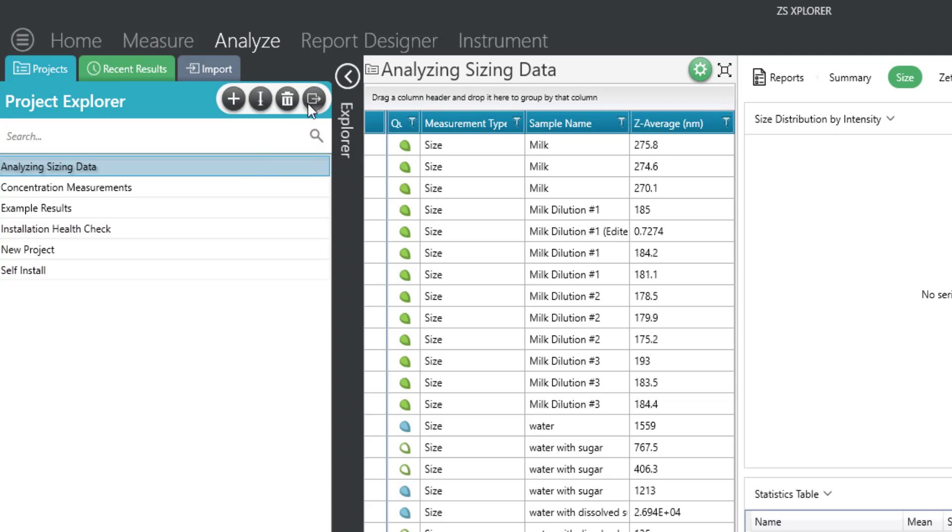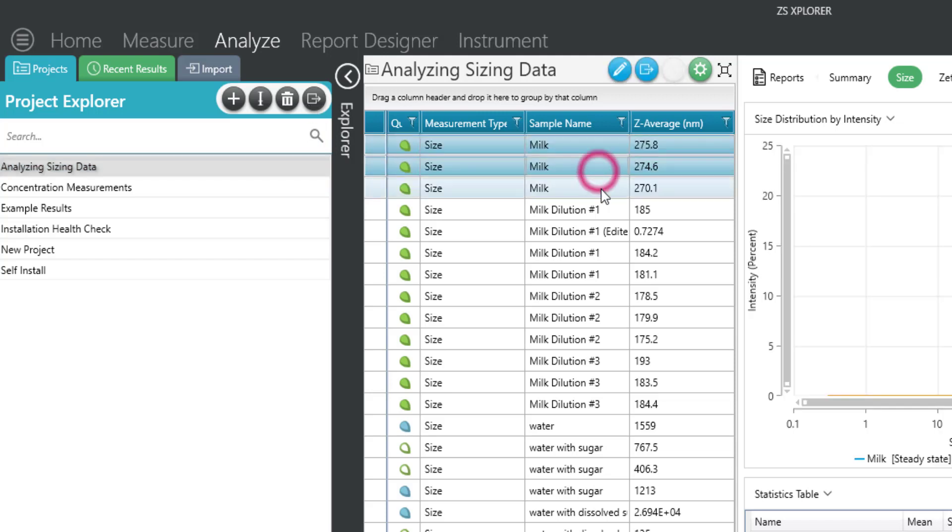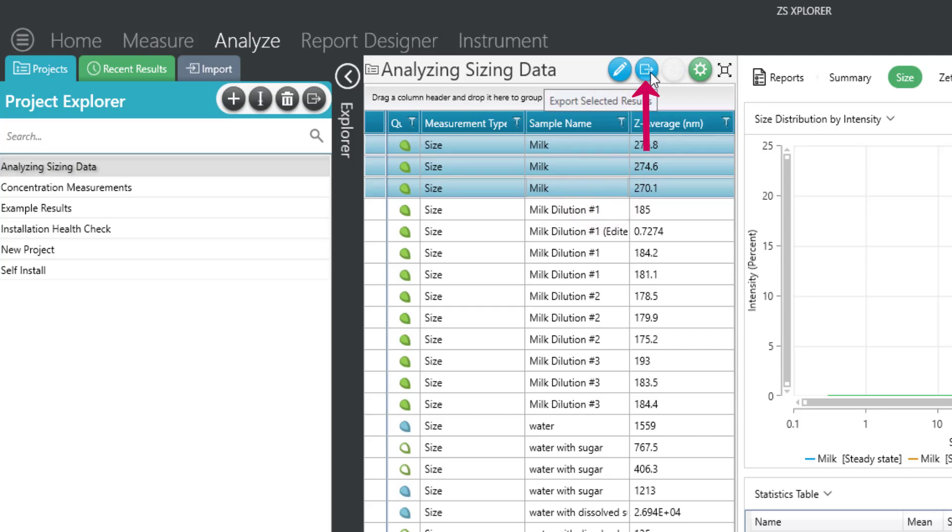If you only want to export a few of the data entries from the project, highlight the records from the record view and click on the export button from within the record view.